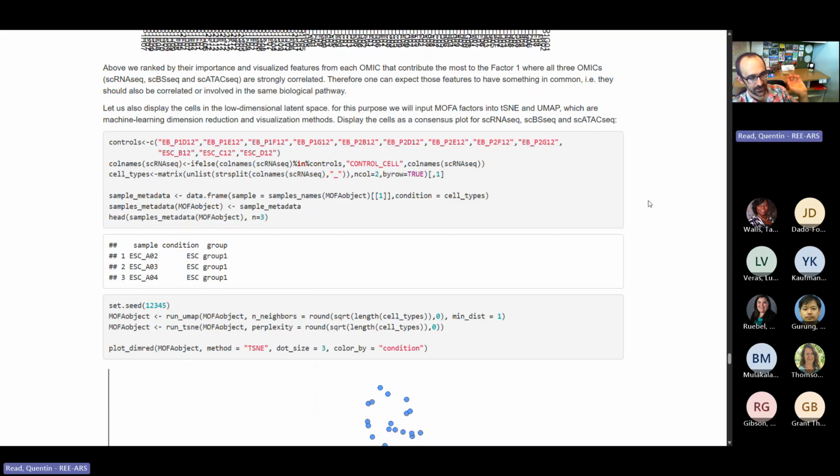Okay, so the last thing that we're doing with this example is, as I mentioned in the introductory slides, a lot of times people will do one of these dimension reduction methods and then use a machine learning based algorithm to further reduce the dimensions and visualize the results to plot how these all shake out. It's kind of just a way to make pretty pictures showing that there's separation between the groups in your data.